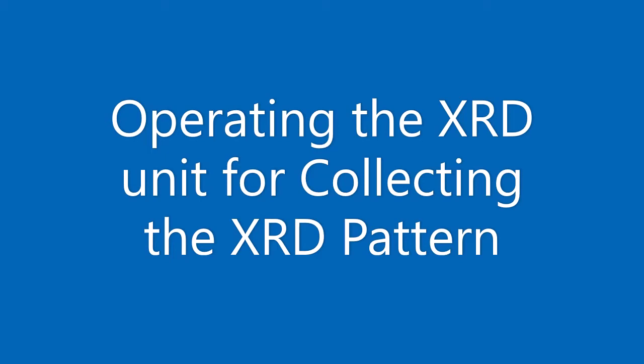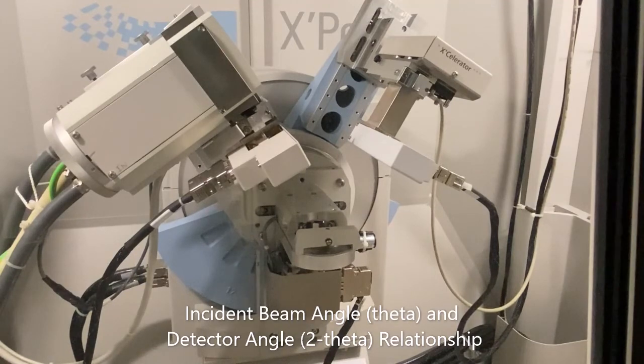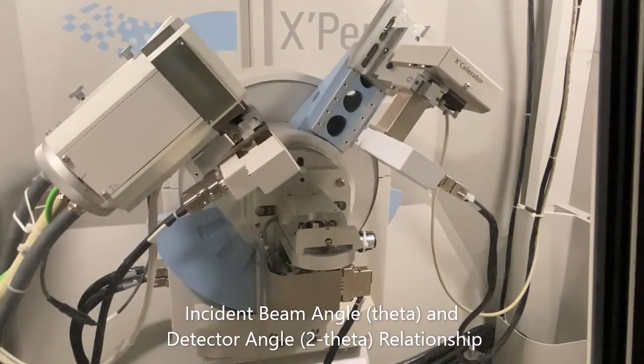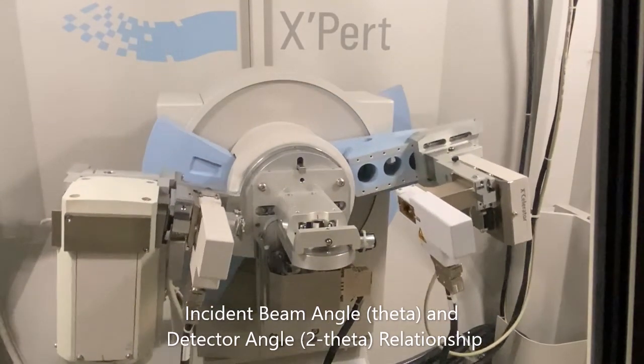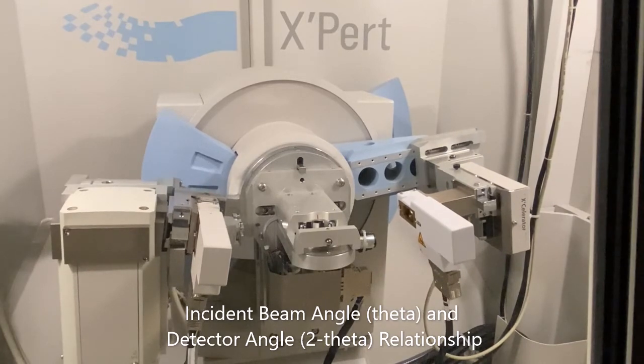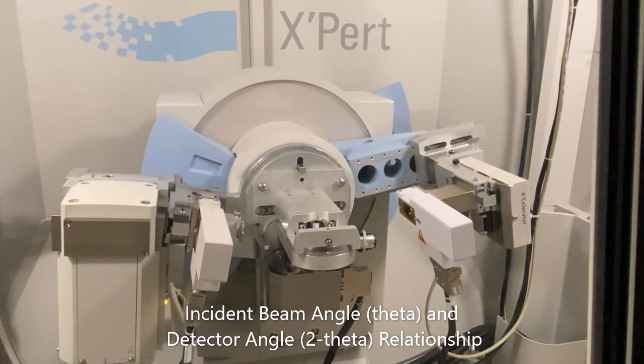Now we will show you the functioning behavior of the entire system while collecting an X-ray diffraction pattern. Here we will show you the workings of the diffractometer itself. Again, on the left side is the X-ray source, the large chamber with the large gray cables connected to it.